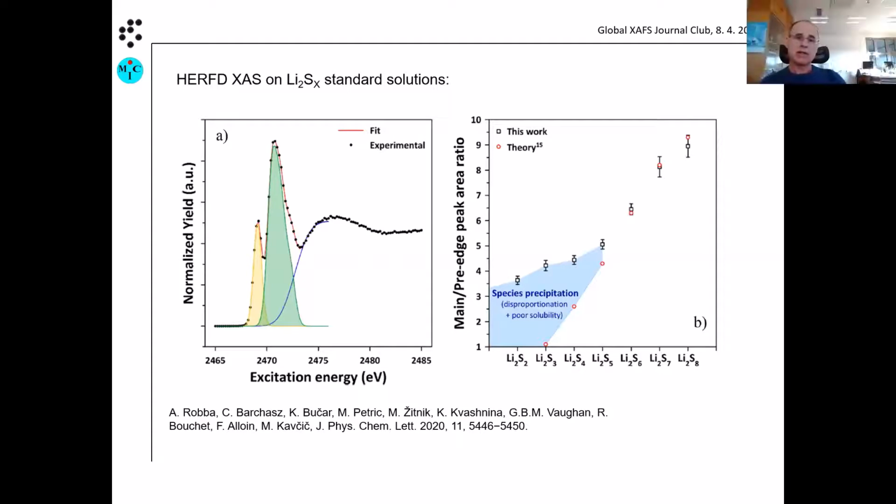Yeah, in all of these experiments I have shown, we always also collect absorption. It's relatively straightforward. We install also just a diode. These are concentrated samples, of course. So we put a diode inside and we record both. And I would say when it comes to quantifying each separate phase, it's difficult to say.